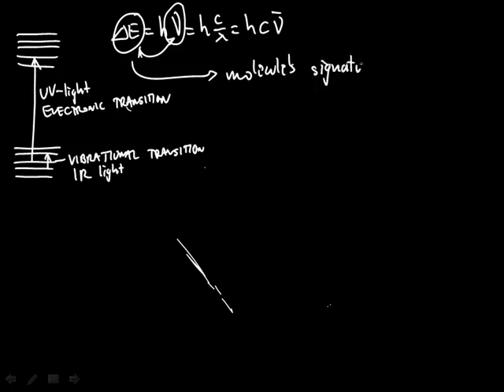in a way, because it tells us what is there that's vibrating at that specific location. A lot of IR spectroscopy can actually be explained in terms of a very simple analogy with a spring, because this is vibrational spectroscopy and springs vibrate.